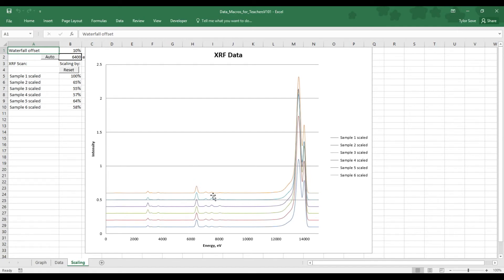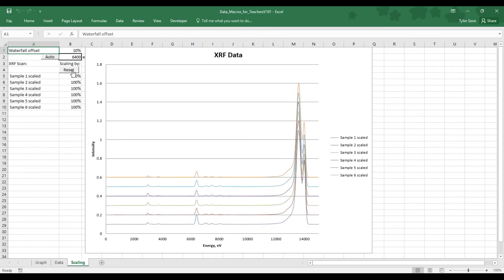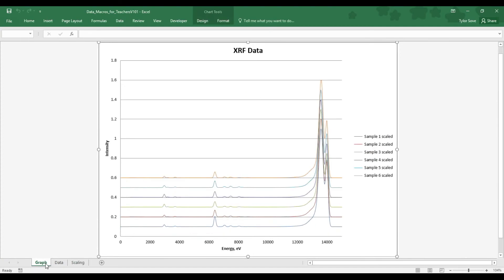Now, from here, if you want to undo this, simply select Reset. Now, to see where all of this is coming from, if we go down over here to the bottom left, we see three tabs. The Data tab contains the data, and the Graph tab contains just the graph.